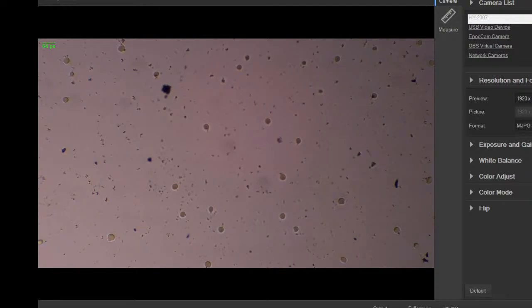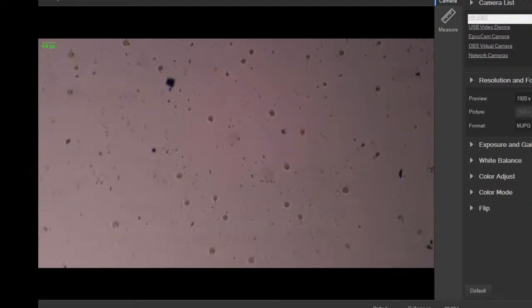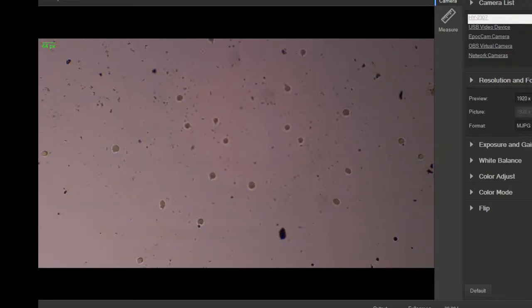The other objectives are, there is a 10mm objective, so that'd be 10 times 10, that's 100. And then you have a 40 power, so that'd be 400. And then there's an oil immersion objective, which is 100 power, and that's 10 times 100 is 1,000. So that's where you really get to see crazy cell details, bacteria up close, at least as close as you can get without an electron microscope, and a few other things.